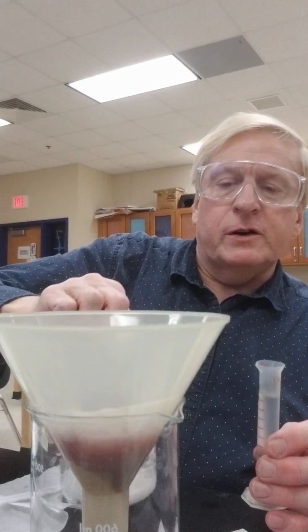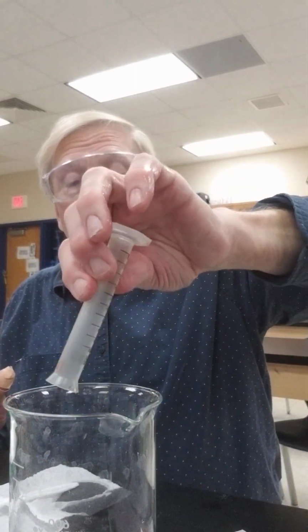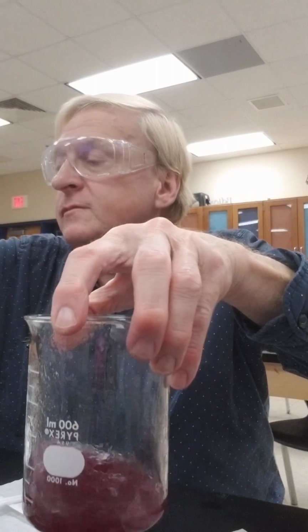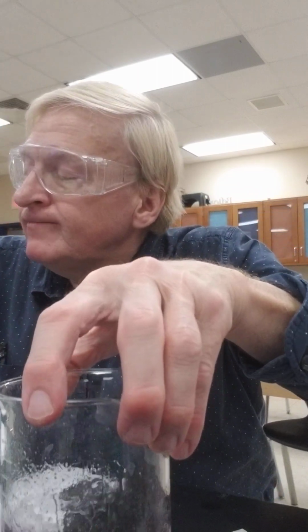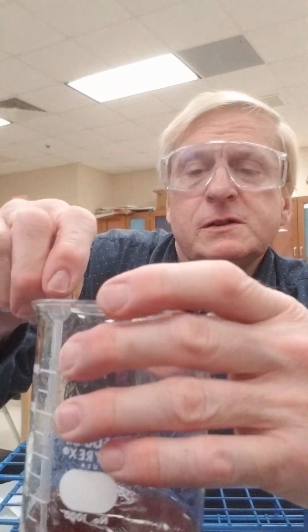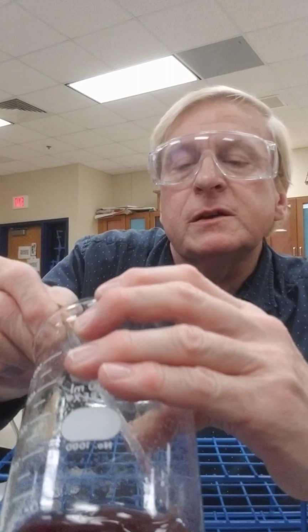I'm going to bring this other beaker back over here, just to avoid a mess. Now I'm going to pour this isopropyl alcohol into the strawberry mixture that has come through on the bottom. I shouldn't call it juice, it's not to drink. You want to swirl it gently for a little while. And then you can use a stirring rod or a pipette. I'm going to have my handy dandy test tube here because I want to pull the DNA out and save it. You don't have to, but I'm going to see if I can find the DNA, after it's stirred a little bit.